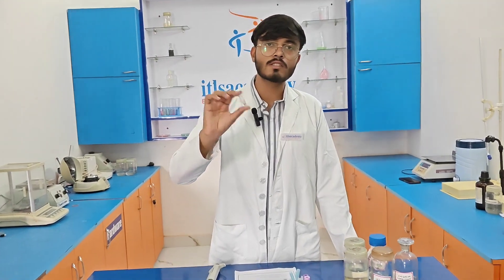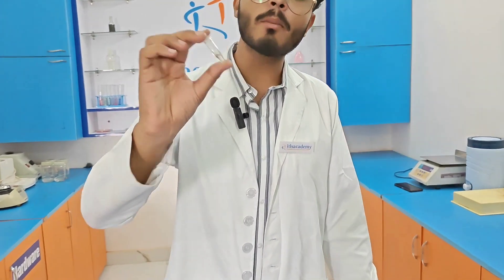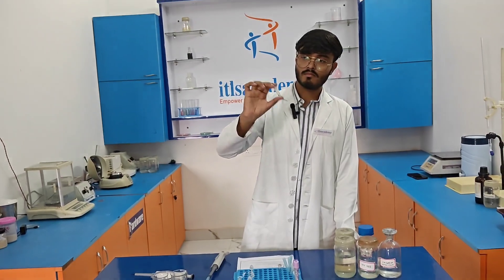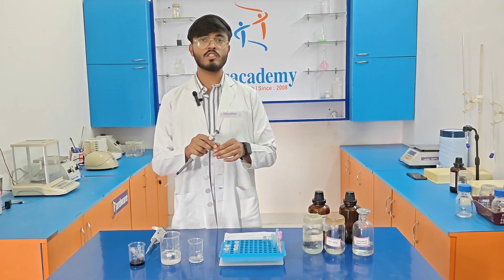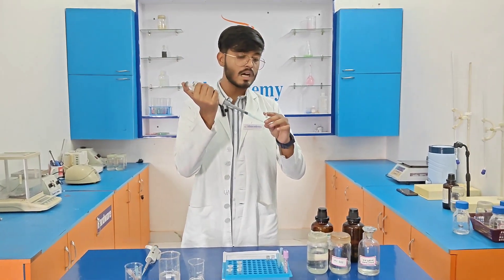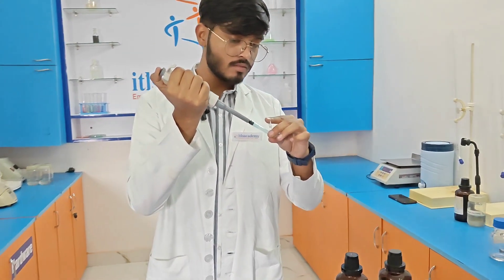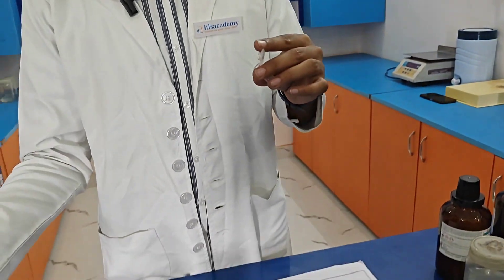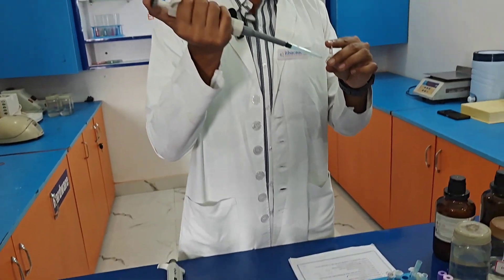After adding 400 µl of distilled water to each eppendorf tube, I am mixing it with the pellets as you can see. After mixing, we perform centrifugation again at 11,500 rpm for at least 5.5 minutes. After centrifugation, I am discarding the supernatant very carefully so that the pellets are not destroyed.